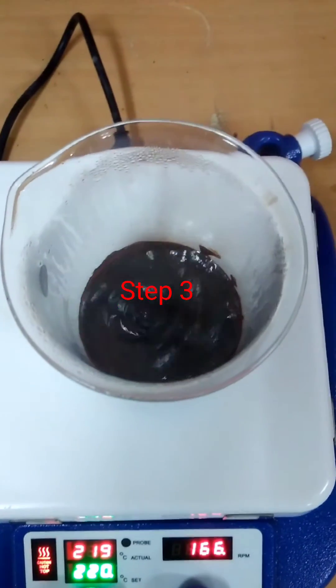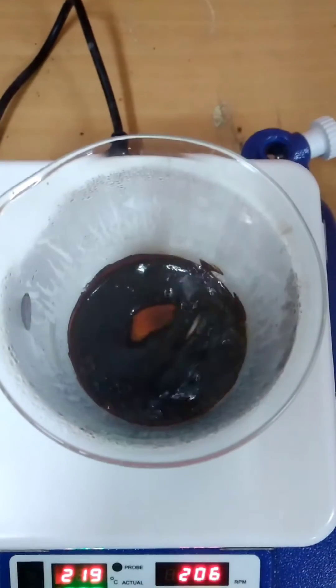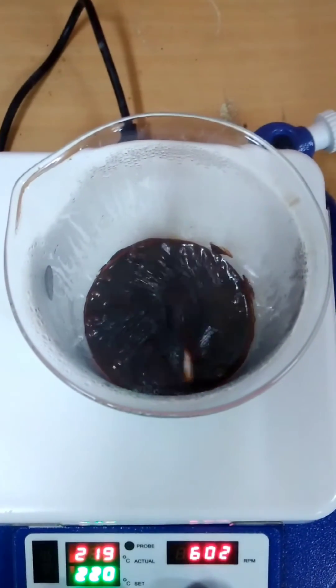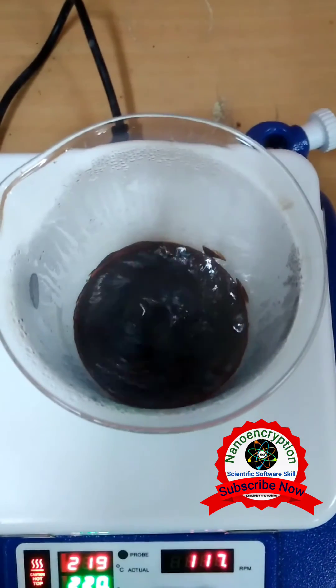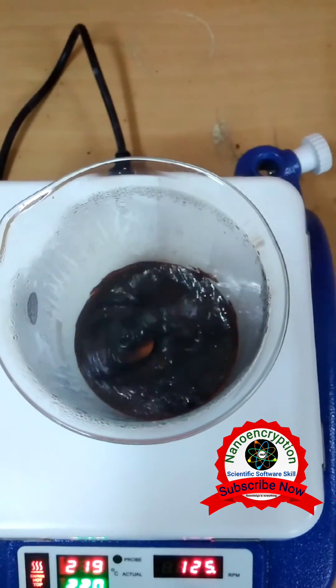Step 3. After that, I have switched off the current, and after a few minutes, I have put it in the dry oven at 150 degrees Celsius for removal of water contents.